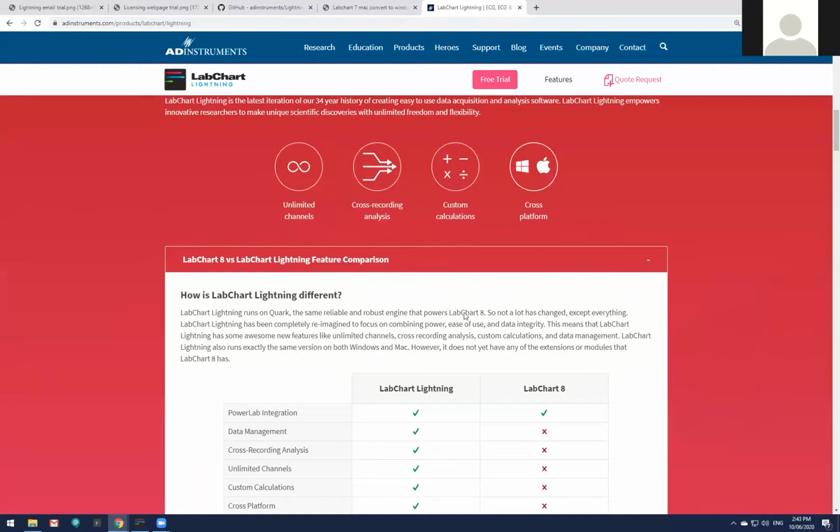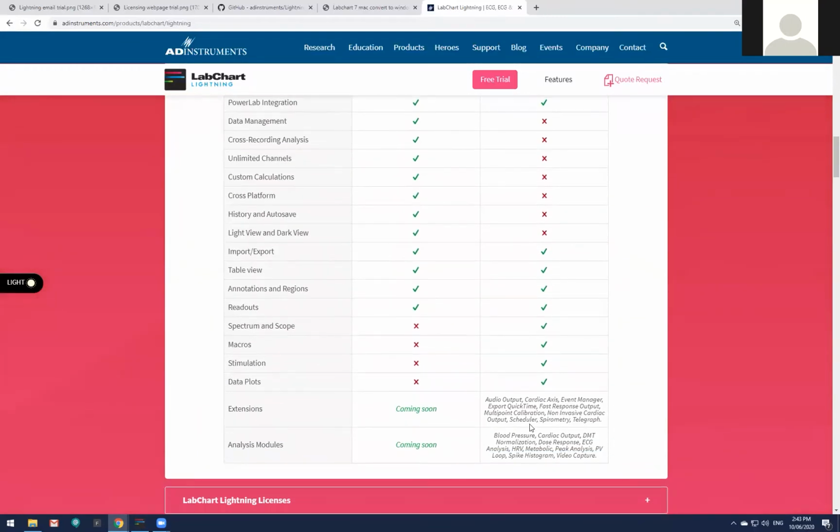Now, the modules that we have are fantastic, but they do have limitations, such as specific calculations built into these modules that you can't change. With the custom calculations feature in Lightning, you can modify calculations to your liking, and then also save these calculations, send them to your peers, and build a library up. So this adds to that freedom and flexibility for users, that they can provide new calculations. It's a sandbox idea, and our team can help you develop these calculations to suit what you need.